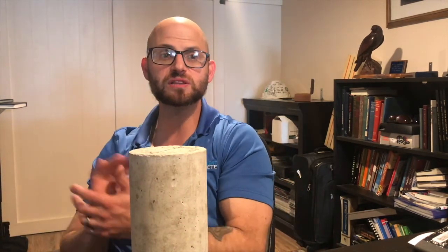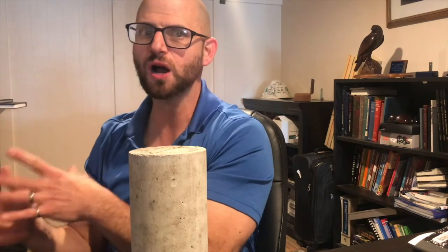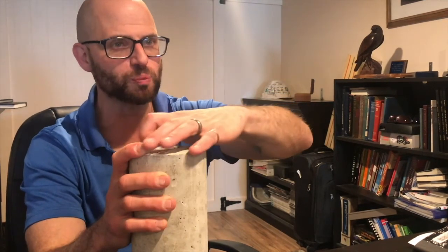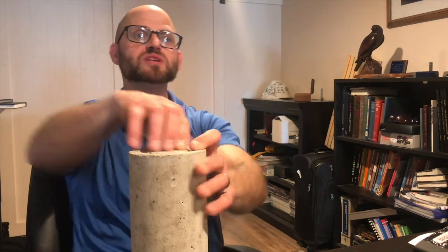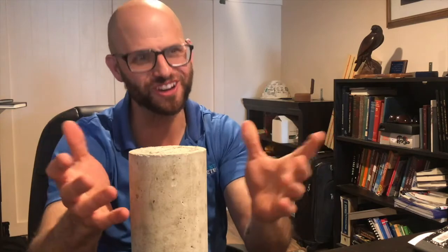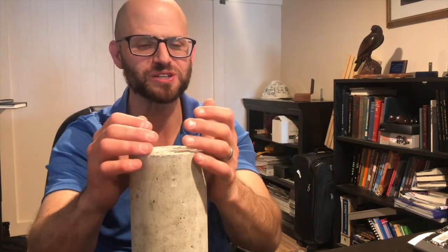And one of the things that we looked at in this scanning electron microscope was the trough itself and how this inferior concrete didn't hold onto aggregate. And what ended up happening, instead of a work hardening or a polishing, you ended up having this rock or this sand being torn out of the cement paste, and just, that really wasn't English or any scientific jargon. Sorry about that. Sometimes sounds describe things better than words.